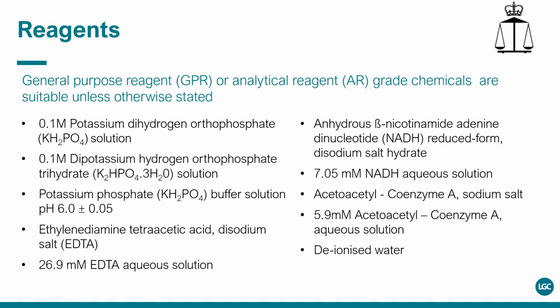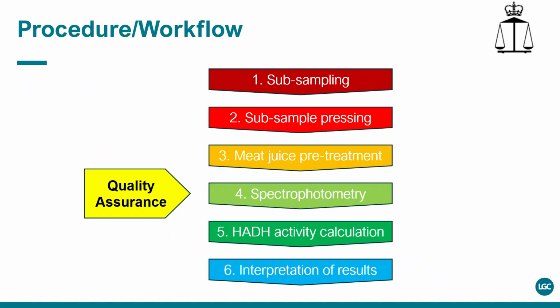Reagents for the procedure are shown, and information on how to prepare the solutions is available later in the presentation, shown in Annex 1. It is recommended analytical grade reagents are used with deionized or similar quality water in the preparation of solutions. The procedure is described by the following 6 steps, which are further explained in the presentation.